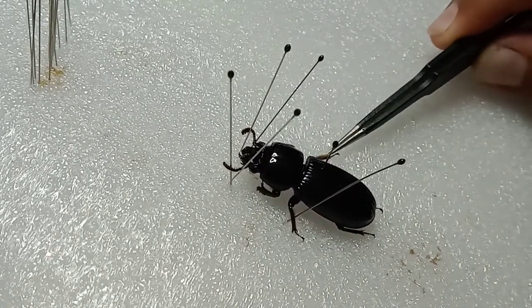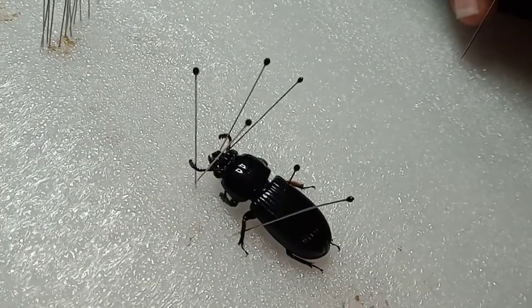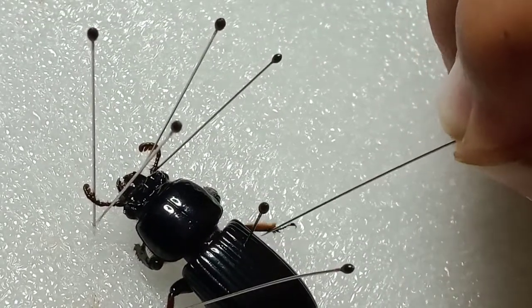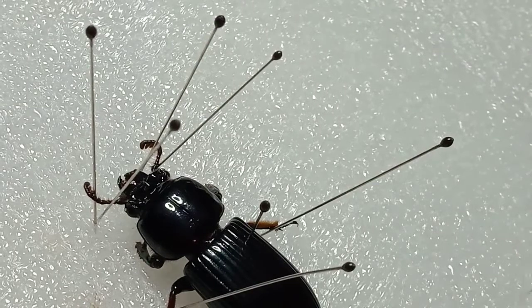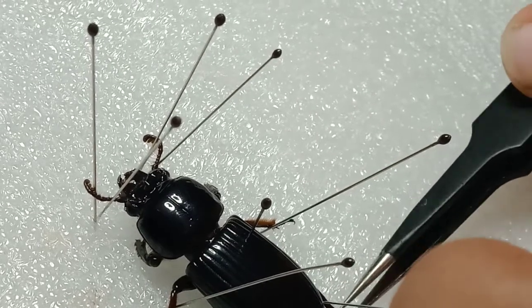Then let's start with the other leg. You want to make sure they look the same. Let me zoom in. You're going to want to get the legs out, then the hind legs.